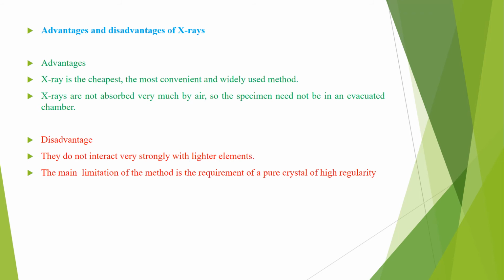So if the sample that is being observed is present in an open air environment, then these X-rays can easily be used to observe the specimen, because X-rays are not absorbed by the air surrounding the sample. And the advantages are these.